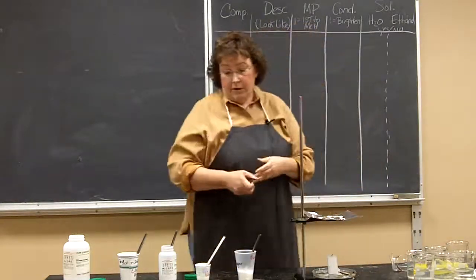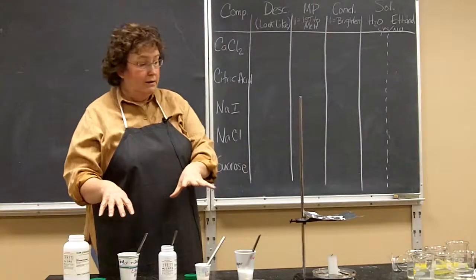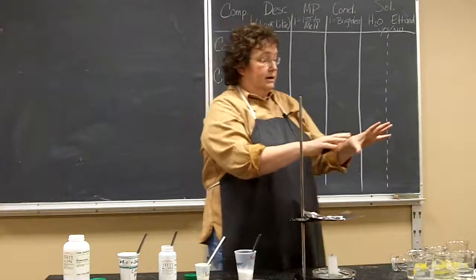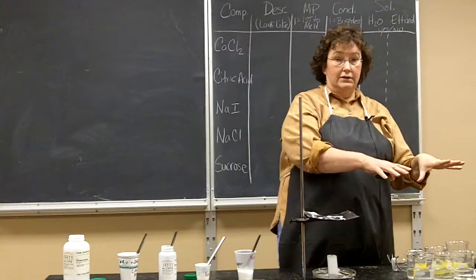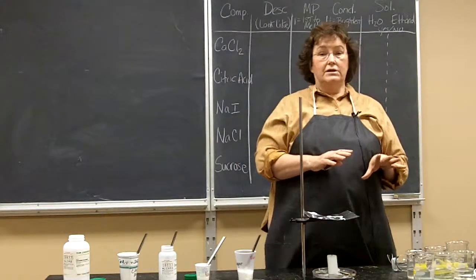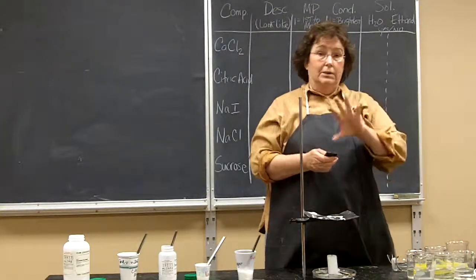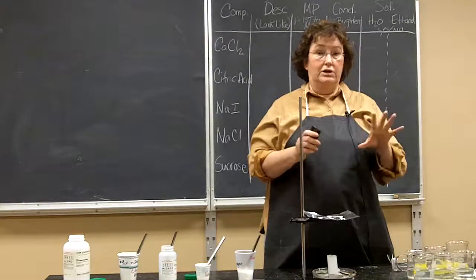So once again, we have just a description. Second test is the melting point. The next test is the conductivity. The fourth test is, what does it dissolve in? The solubility. So I'm going to have a short video clip for each of these tests.